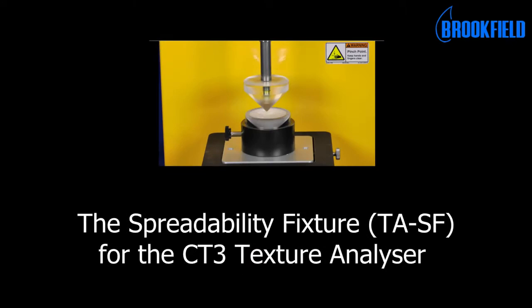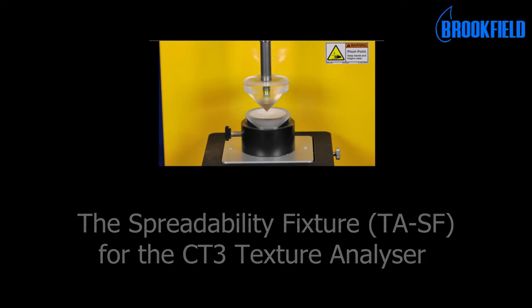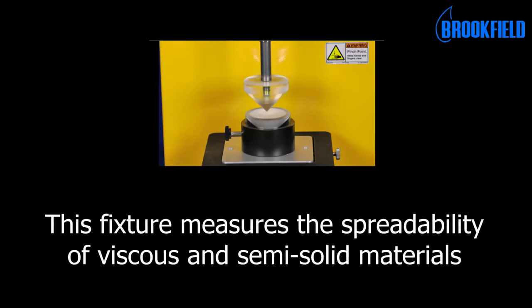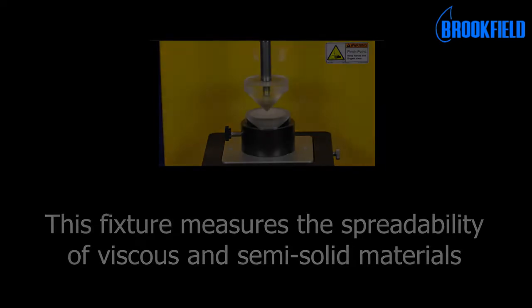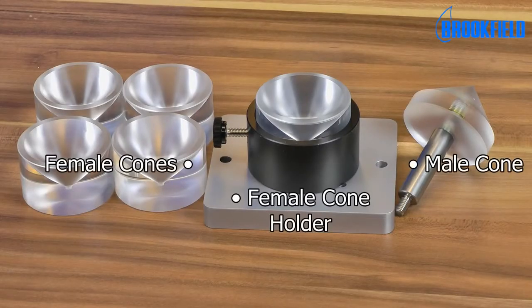This is the spreadability fixture for the CT3 Texture Analyzer. This fixture measures the spreadability of viscous and semi-solid materials. Here you see the individual parts of the fixture.